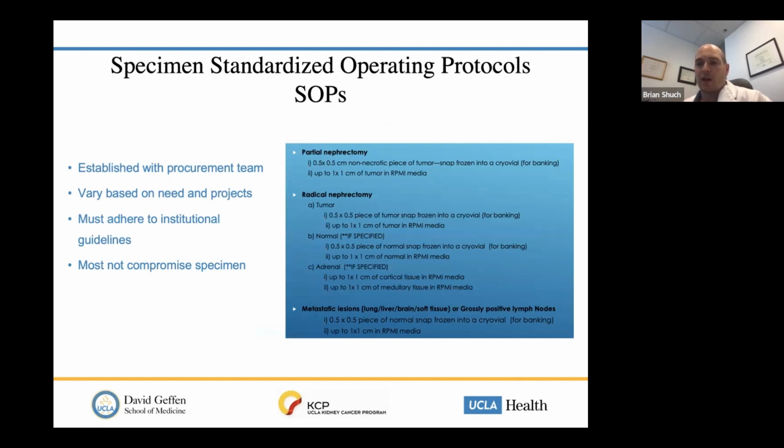And they're trying to argue that your SOP says you need to collect for a tumor that's 1.5 centimeters, and this is 1 centimeter. So make sure you know what you wrote and make sure that you have buy-off, because they're going to follow it like the Constitution. But basically you have to have it signed off by the pathologist and procurement team, and they'll try to follow it every time.